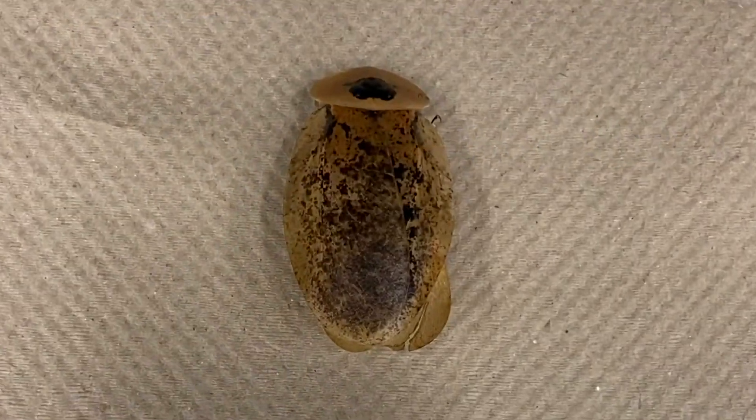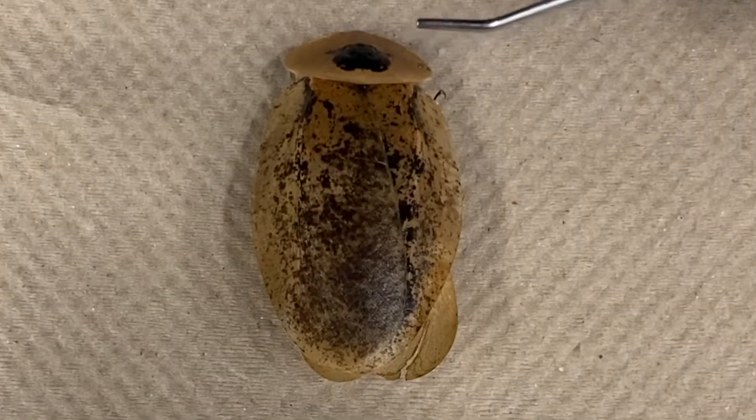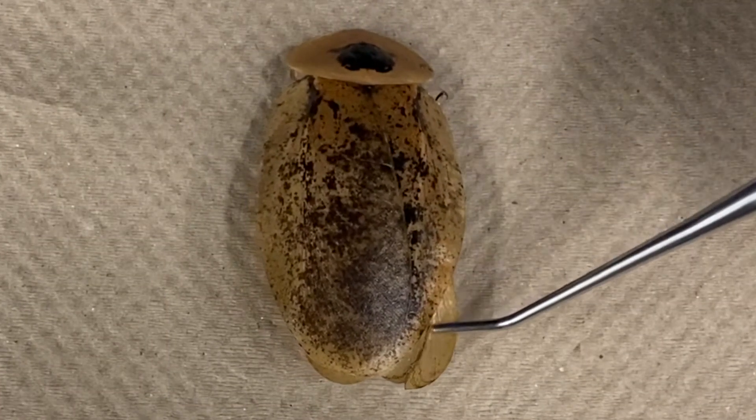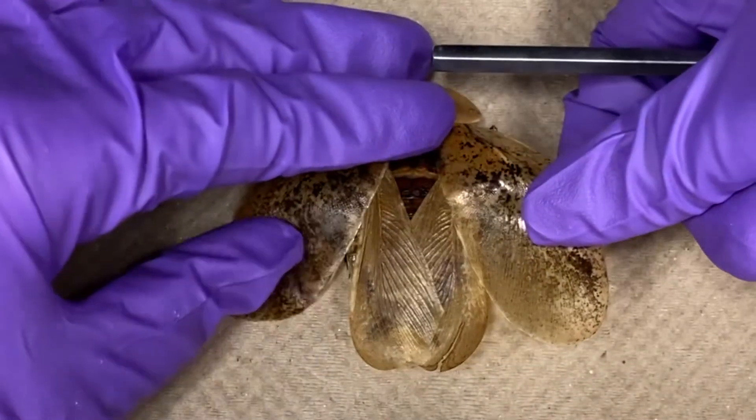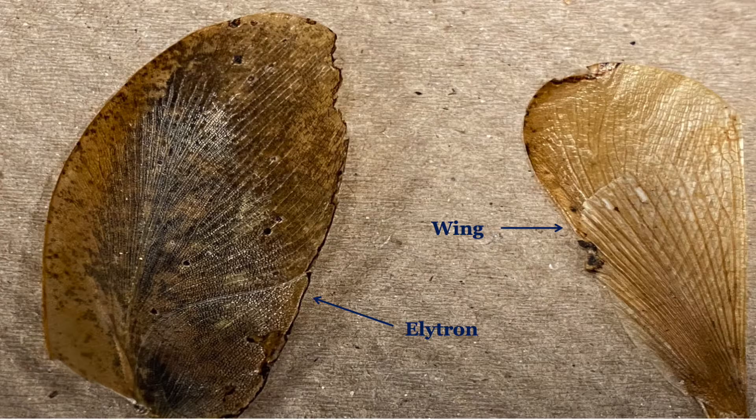Let us now examine the dorsal side. There is less visible on this side, but you can see the pronotum, elytra, and maybe the ends of the wings sticking out. The two elytra, or fore wings, cover and protect the two wings found underneath, but these cockroaches do not fly.